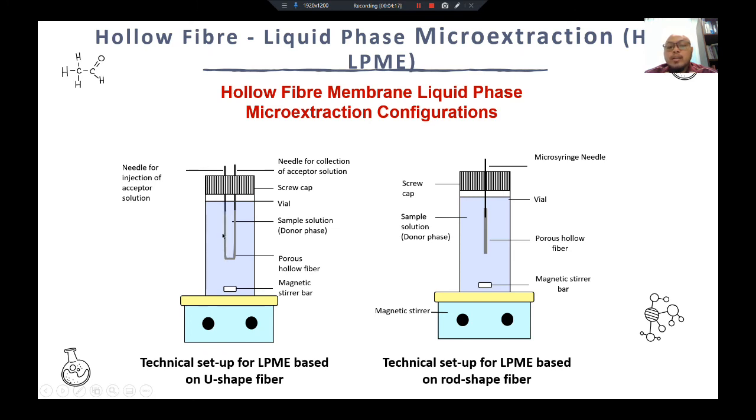Maksudnya kita mungkin, okay, kita full untuk yang pertama dan kita extract, lepas kita tambah lagi, kita extract. So we can do it more or less continuously lah, walaupun not really continuous lah. But I believe science, macam yang kita tahu in the quotes earlier, science is the advancement of the imagination kan. So kalau kata kita boleh automate this particular system, okay, it will be a great factor to science. I'm not really sure dah ada ke tidak, but that is the idea lah, how we can do that.